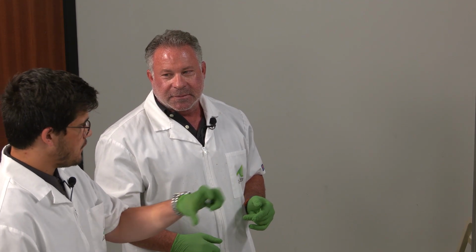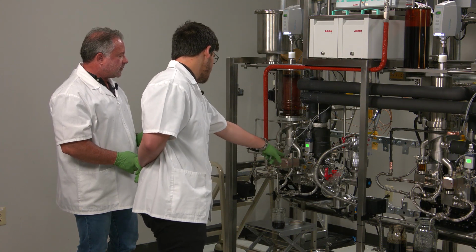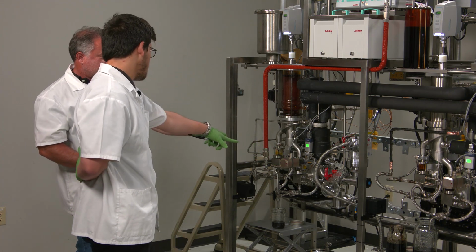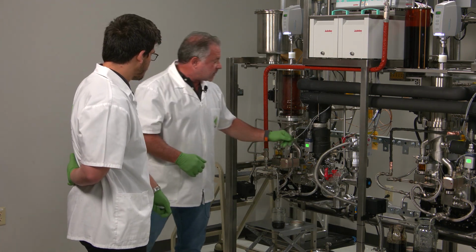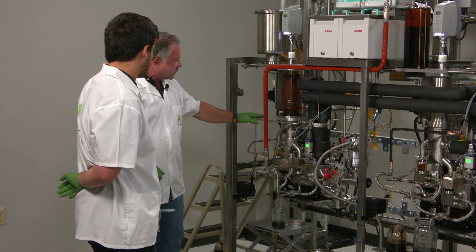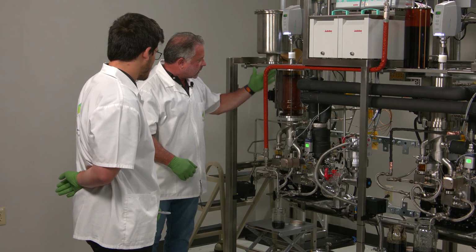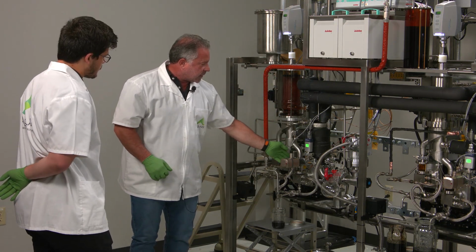So it's a specifically selected temperature to try to capture a section of what you're actually pulling off, because we still have some stuff coming in through the cold trap, but not everything is desirable. And right. And oftentimes our cold trap here, so this is our condenser, residue, evaporator, condenser, residue, distillate.